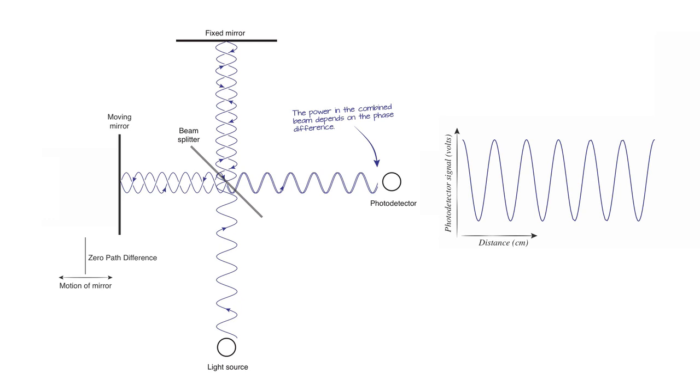Now that I know the wavelength of the laser beam, if I knew the frequency of that laser, I would be able to calculate the speed of light. If I knew the speed of light, I would be able to calculate the frequency. So other work by other scientists had determined the frequency of a particular band of light, and from using the interferometer, Michelson was able to determine a very precise number for the speed of light, and that's really what he won the Nobel Prize for, determining the exact speed of light.